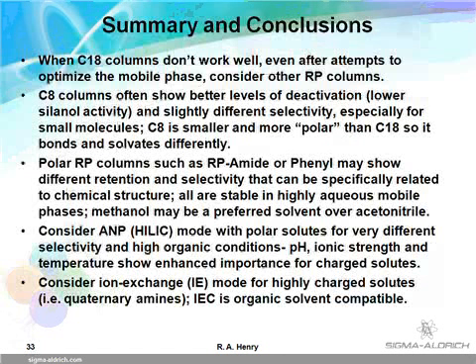Polar RP columns, such as phenyl and RP-amide, are very complementary to C18 and C8 in that they show different selectivity for polar molecules. When all four popular RP phases prove to be inadequate, a different HPLC mode can be explored.